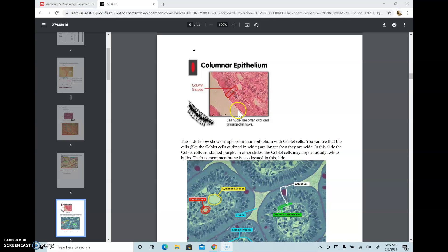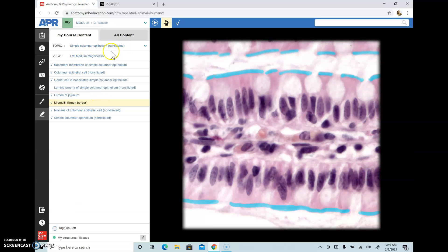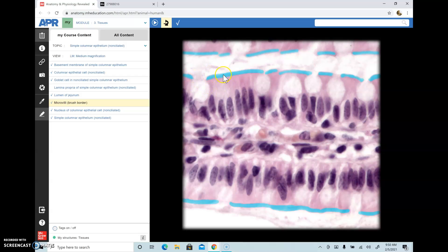The first type we're going to look at is simple columnar epithelium. The nucleus is situated slightly towards the basement membrane. We can see microvilli, also known as brush borders. Wherever you find a lot of absorption going on — for example in the small intestine and the tubules of the kidney — you will find microvilli. Brush border increases the surface area for absorption of substances.